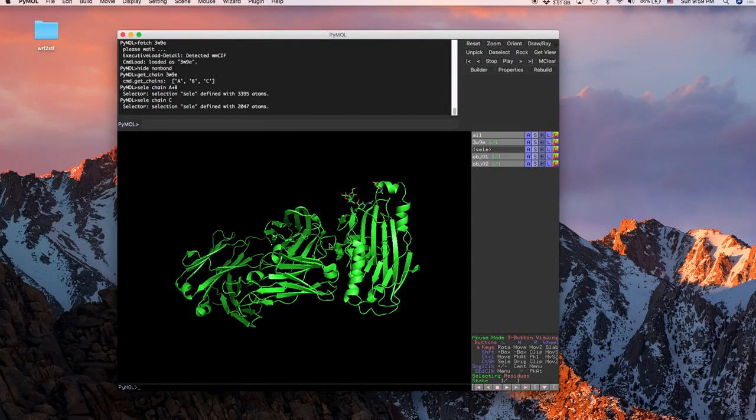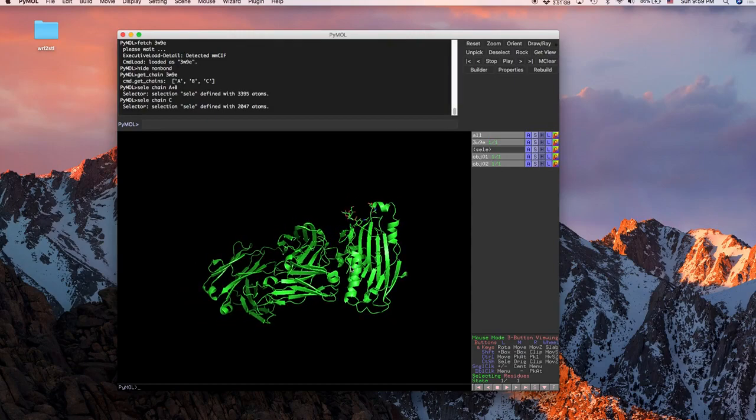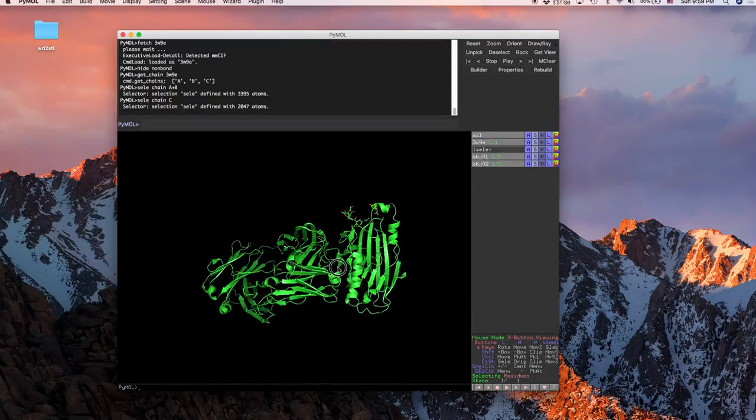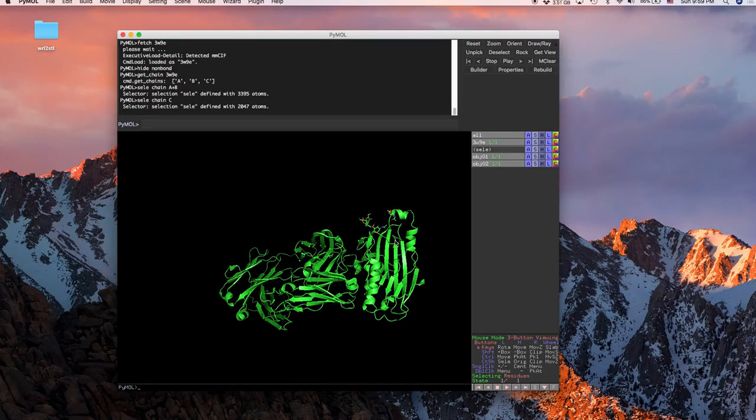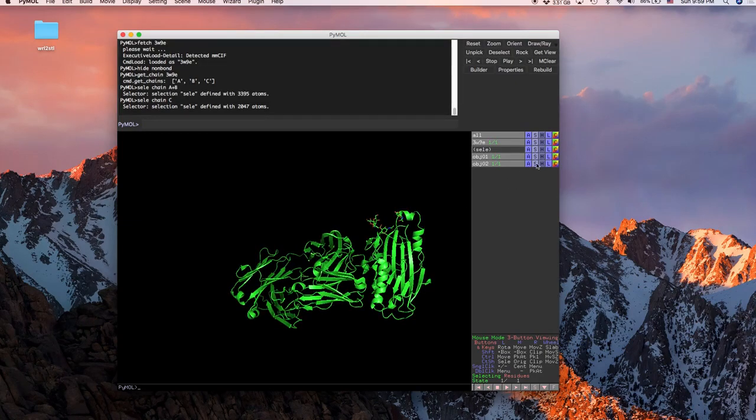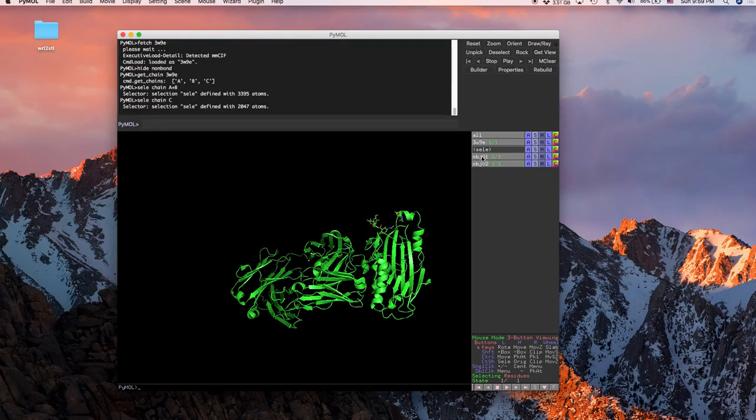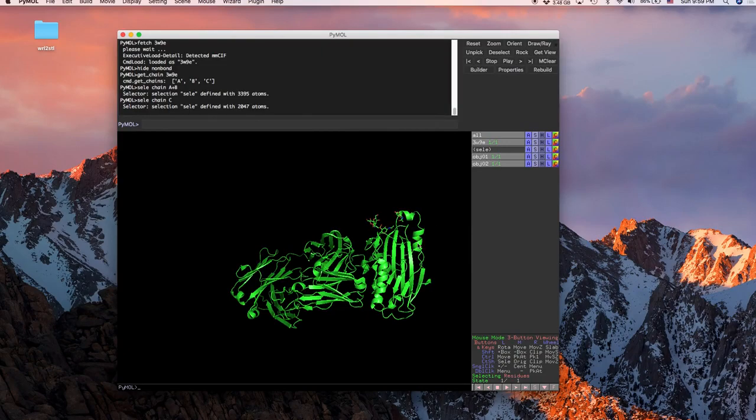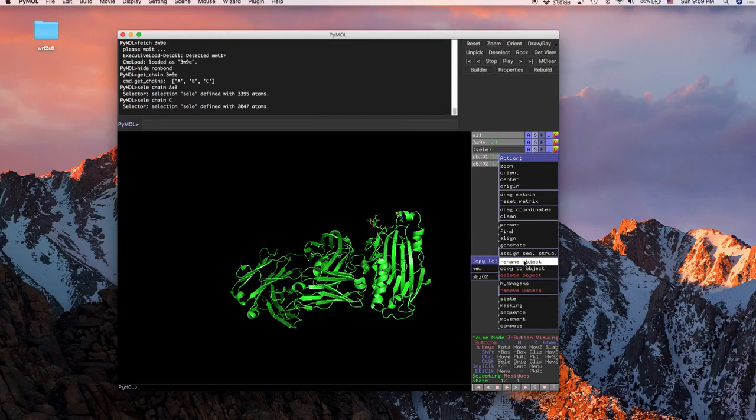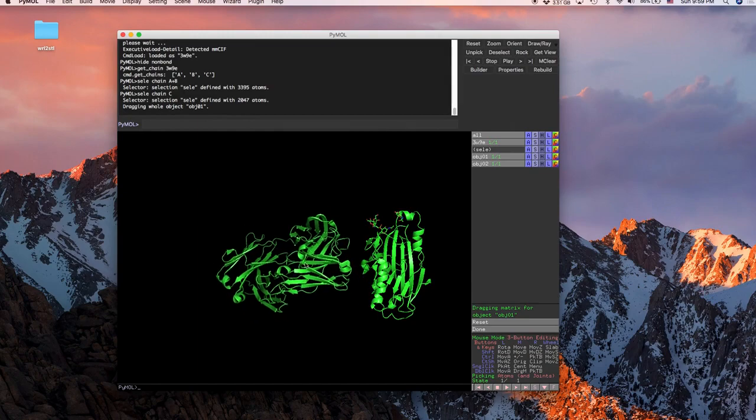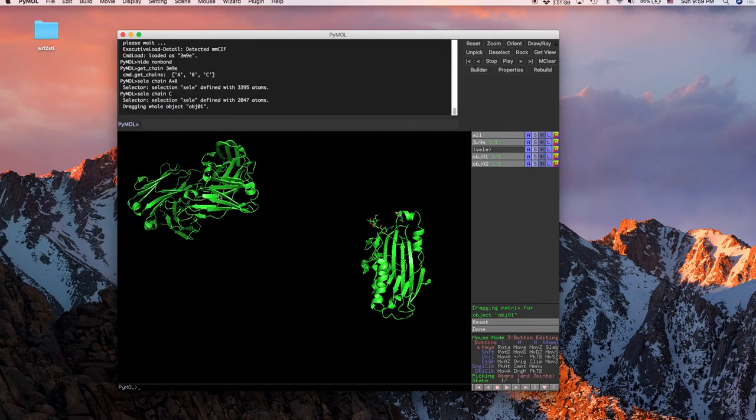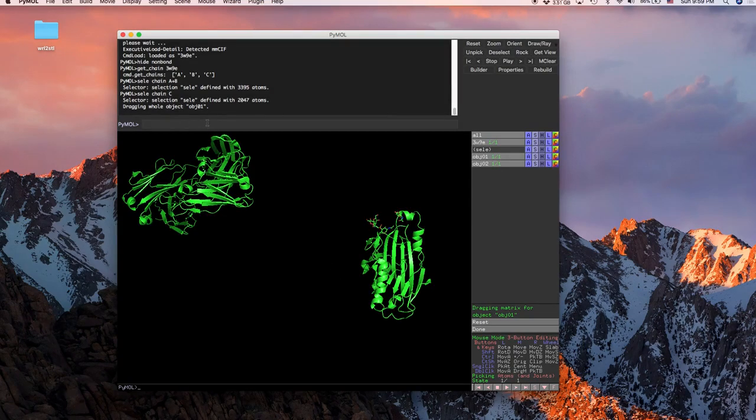So now that you have both of them made into two separate objects, right now they're already together and we're going to want to show them coming in together. So what you're going to want to do is object one was the thing that's actually going to be moving and docking into this, this is going to be the receptor. So for this one action, we're going to go to drag matrix and we're just going to move this wherever we want it, just away from where it's supposed to be. This is where we're going to start typing in some things, so follow these pretty closely.